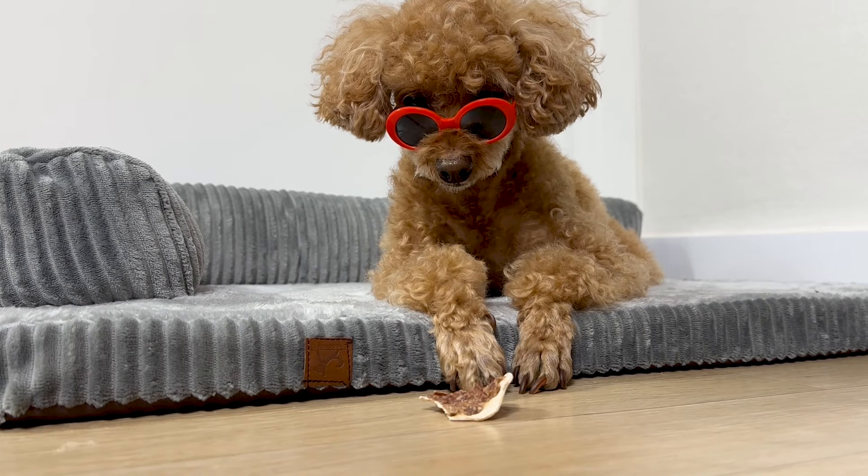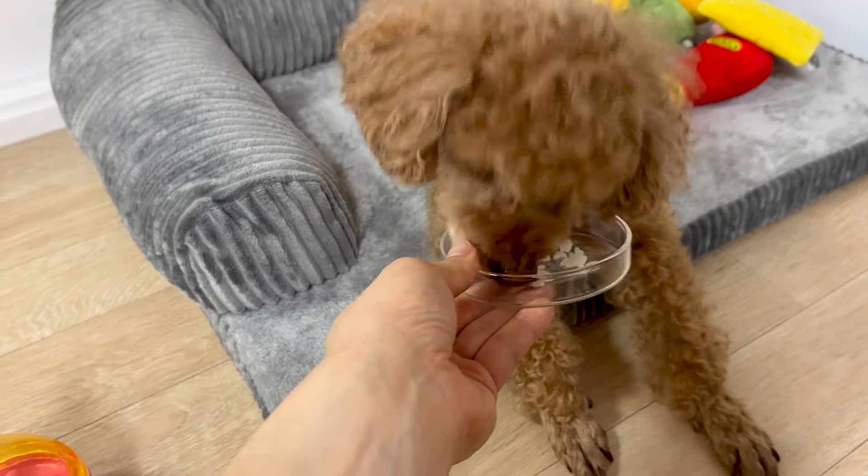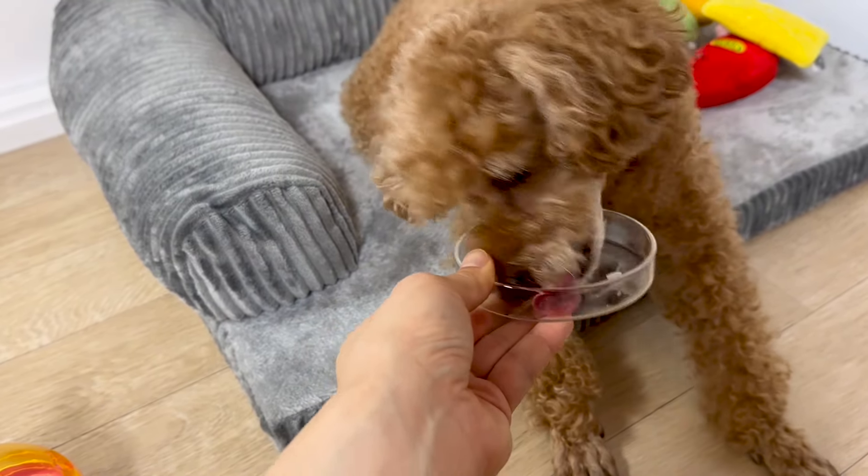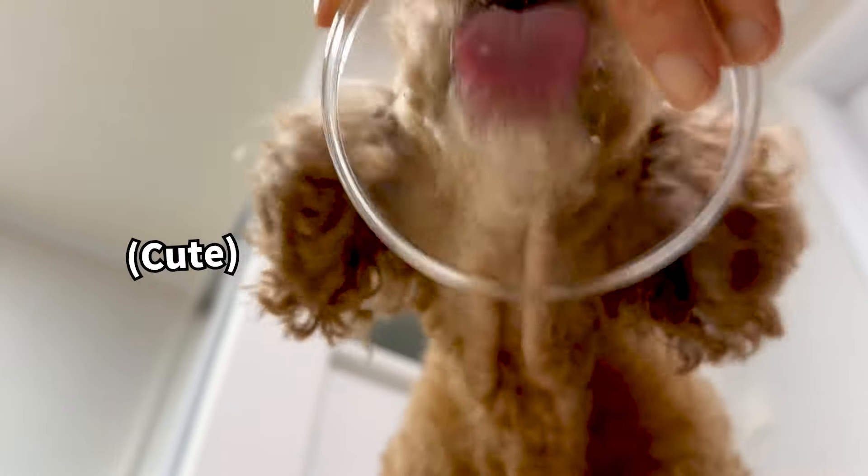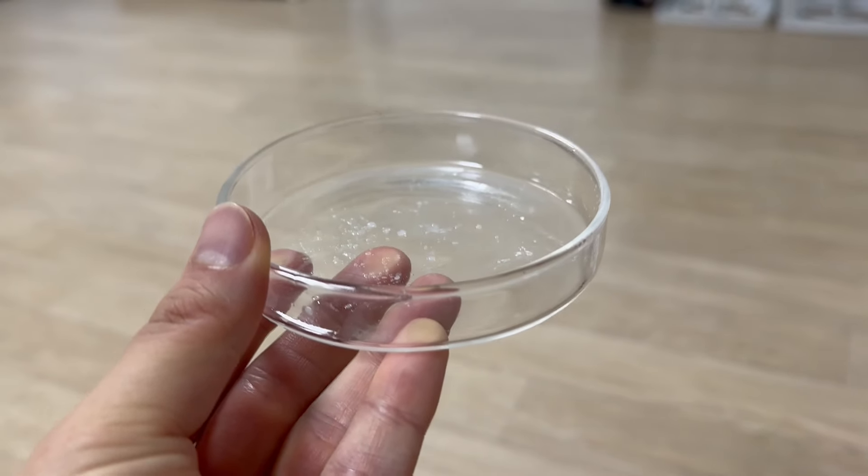However, he wasn't too fond of this method, so I placed a grain of rice on the plate to collect the saliva directly. And it worked perfectly. Thus, I successfully collected a good amount of saliva from Prince Buddy.